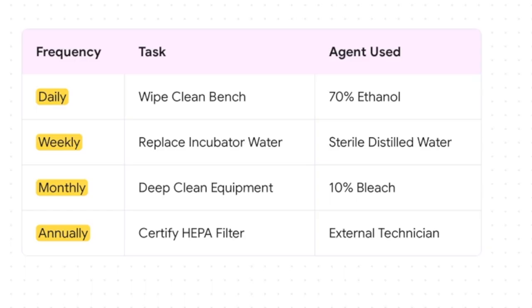Every single day, the bench gets wiped. Every single week, the incubator water is changed. Every month, a full deep clean is performed. And every year, a certified technician comes to make sure the HEPA filters, the actual lungs of the Biosafety Cabinet, are working perfectly.